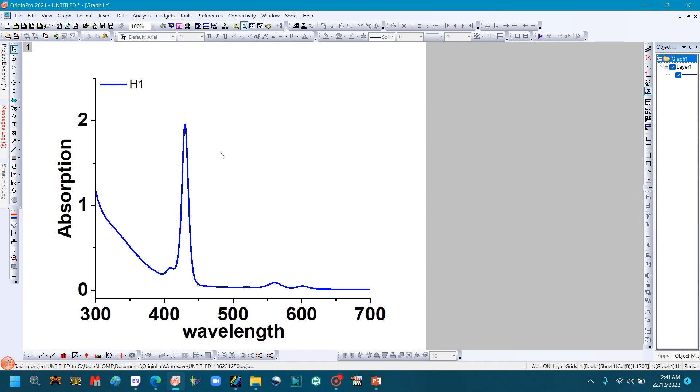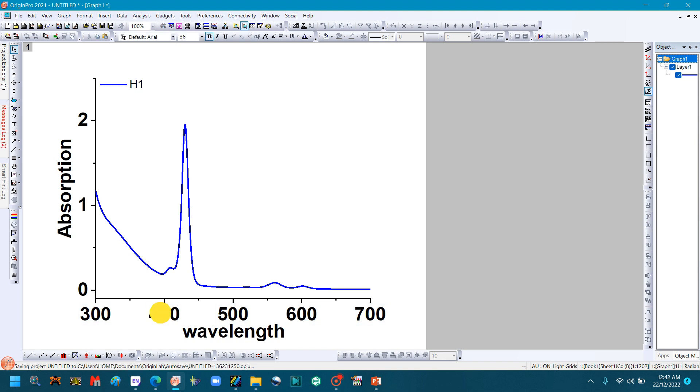Now we will make the zoom graph. In the UV graph, this is the Soret band area, and these are the Q-bands area. So mostly we attach the zoom file of the Soret band area. So we will make this zoom file. Double-click the x-axis.